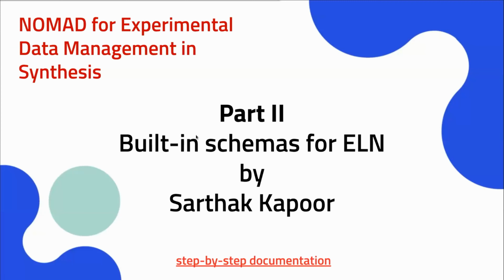So I will just quickly wrap up what Sarthak said. So thank you, Sarthak, for this very nice demo of the functions we have available in the ELN. I hope you can already see my slides. If not, you can just shout.